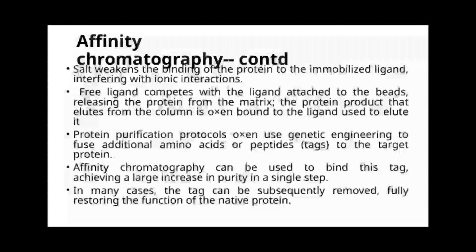Another advantage is that, in many cases, we can remove the tag after purification, which helps restore the native function of the protein completely. So, to sum up, affinity chromatography is a powerful technique, especially when combined with tagging strategies, as it simplifies purification and can preserve the protein's natural activity.